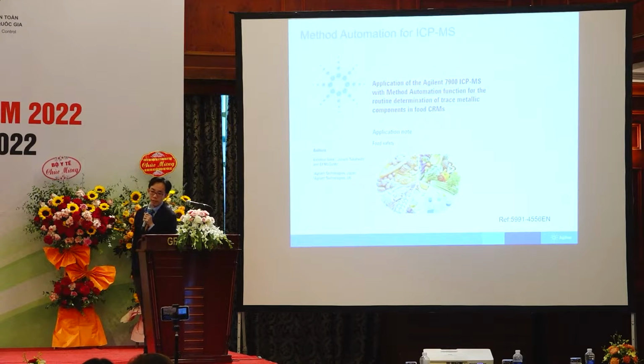In the slide, it will let you have a look at the full application note. This is basically a way which we automated the method setup on ICPMS.